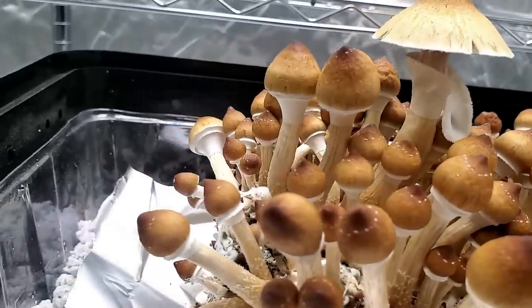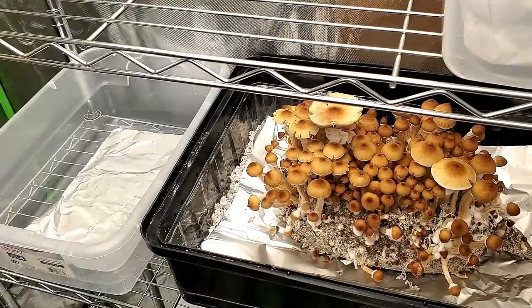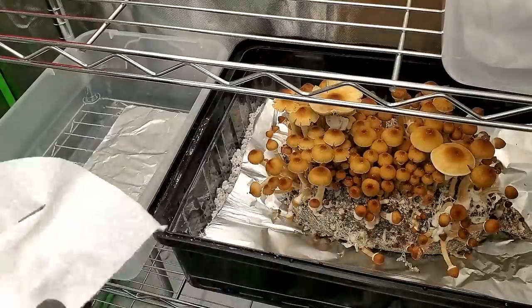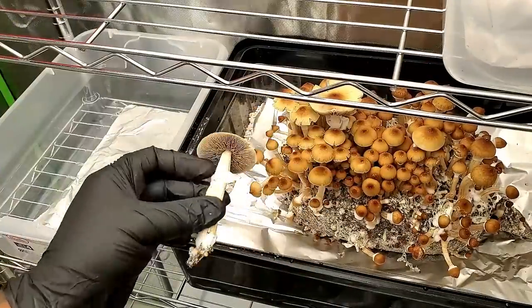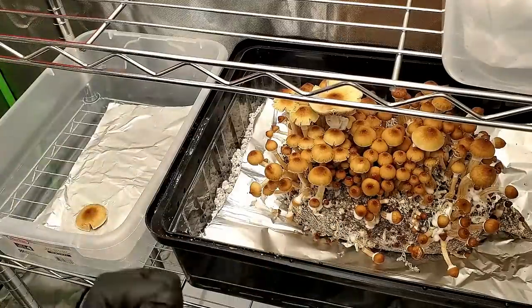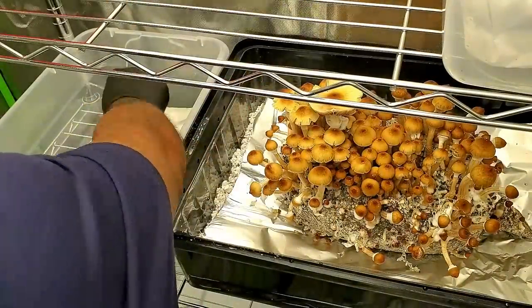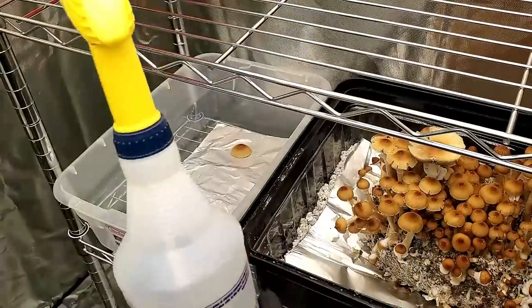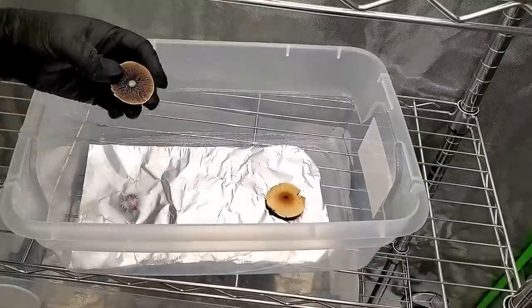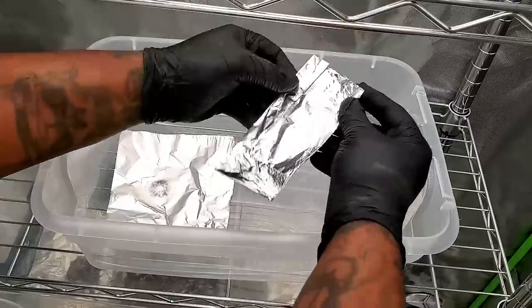Before we get into that, let me give you a quick recap of how we got to where we are today. Three months ago on the channel you guys saw me take a spore print for the first time — it's very easy to do. I've added a new playlist called 'Spore Print to Flush.' The first episode is when I took the spore print, and this episode we're doing spore print to agar and spore swab. The goal is to go through the entire process of growing mushrooms all the way from spore print.